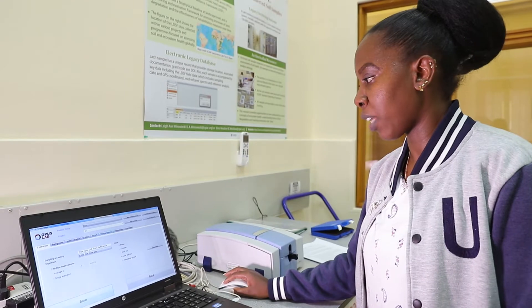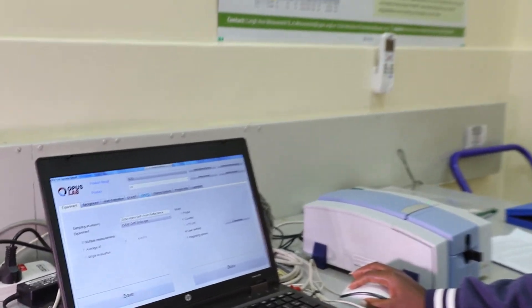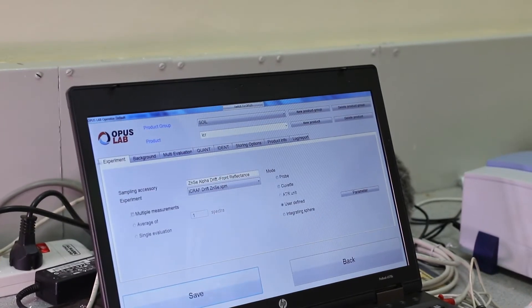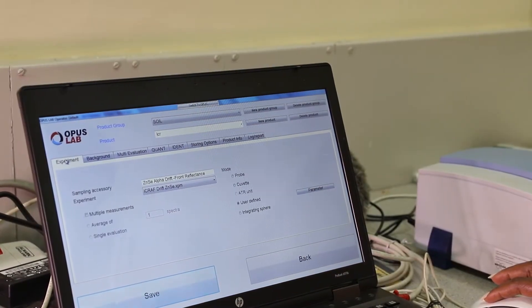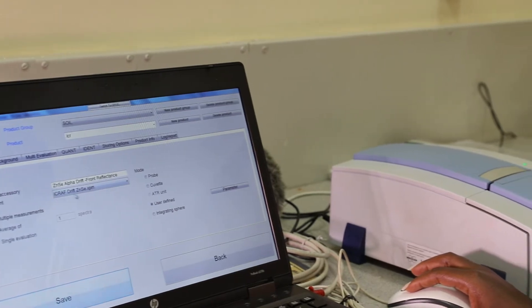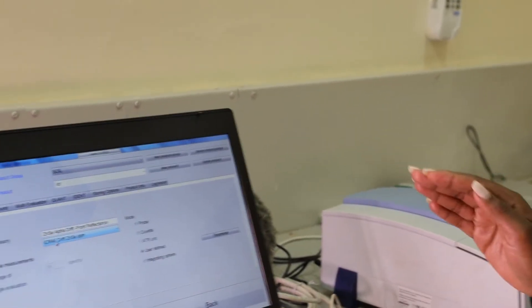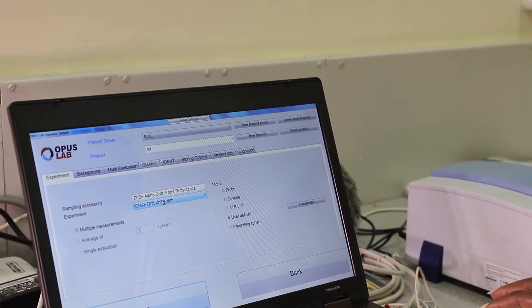In the OPUS LAB we have all these icons: Experiment, Background, Multi-Evaluation, Quant, Ident, Storing Option, Product Info, and Log and Report. In the Experiment tab we have the sample accessory, which is the zinc selenide Alpha Drift front reflectance. The method selected in the Experiment matches what is used in OPUS LAB — which is the ICRAF drift zinc selenide.